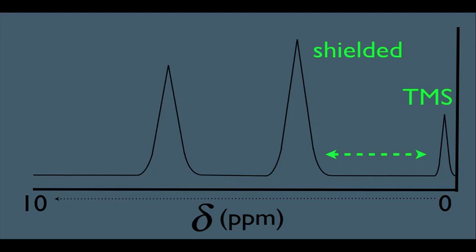And using the same logic, the further away a peak is from TMS, the more it's not like the hydrogens in TMS, and the more de-shielded it is. Also, please keep this in mind.